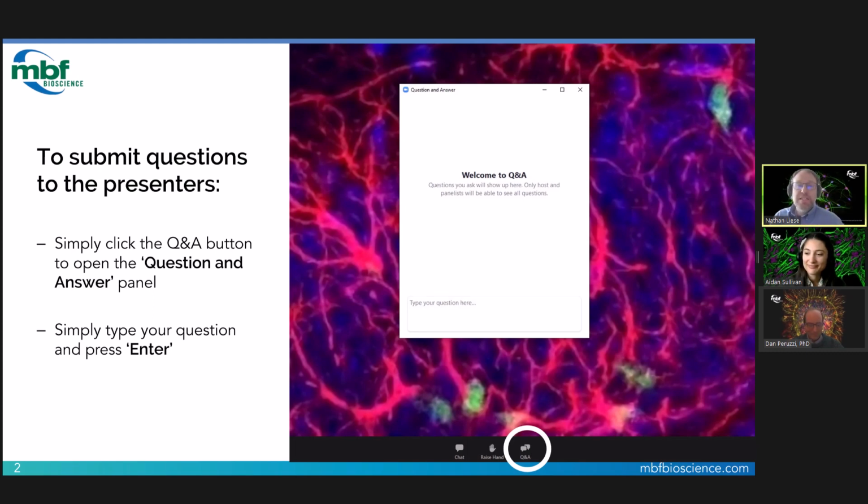In this presentation, Dan will be helping Aidan with getting started using unbiased stereology to answer her research question. Let's listen in.